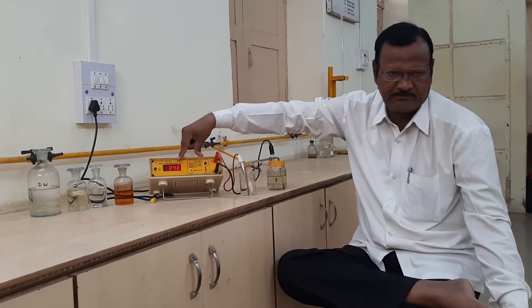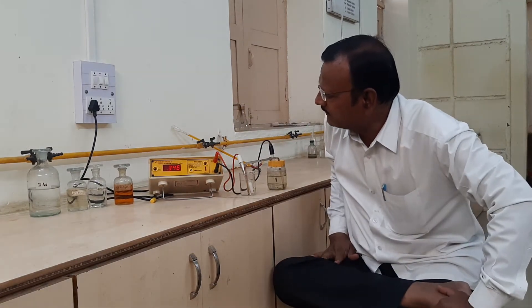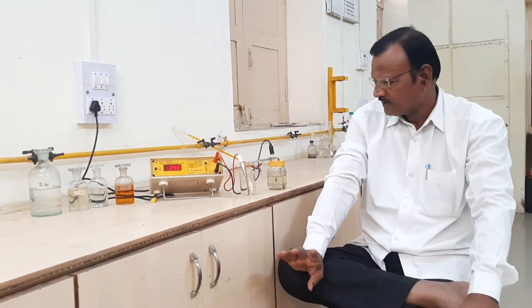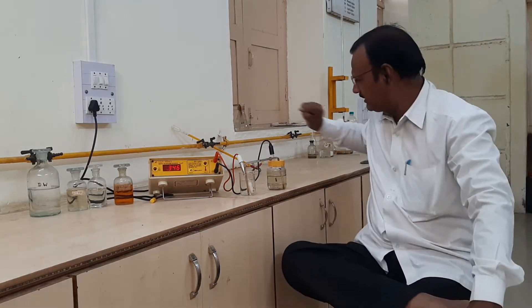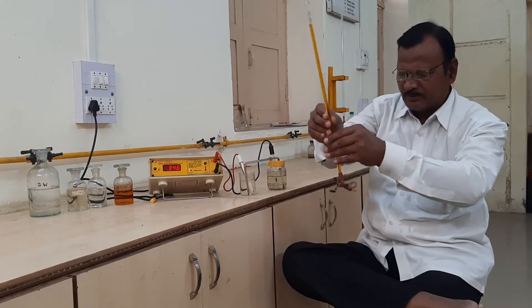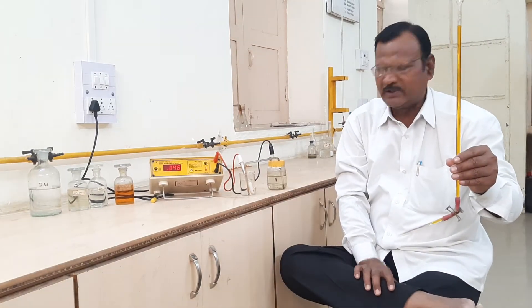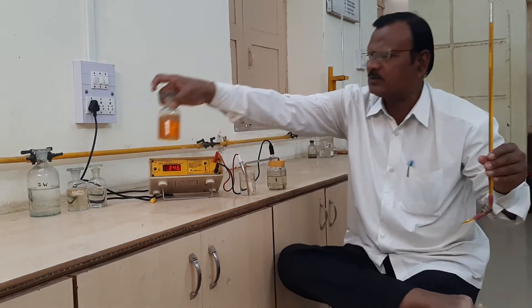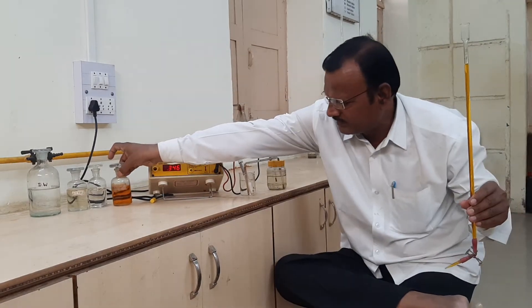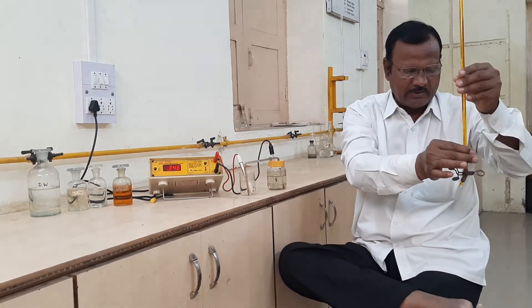The first reading observed on the potentiometer is 0.346 volts. This is our first reading. After observing the first reading, we fill the burette with potassium dichromate solution, remove any air bubbles, and prepare to add the dichromate solution to the beaker.